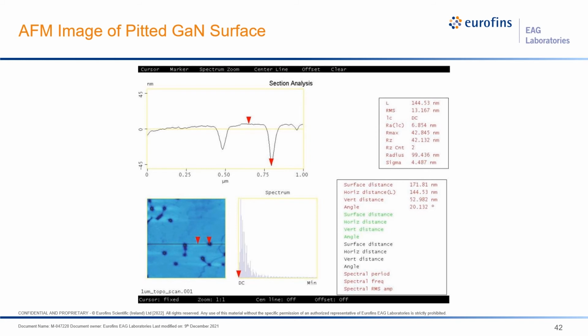And when you're trying to make a measurement of, say, carbon in the top 20 nanometer region as you're profiling down, and these pits have all these carbon contaminations from air exposure, when you break into it, you'll still be seeing carbon, and you might be thinking that it's a carbon diffusion from the surface in these layers, but in reality, it's an artifact of these impurities in these pits.